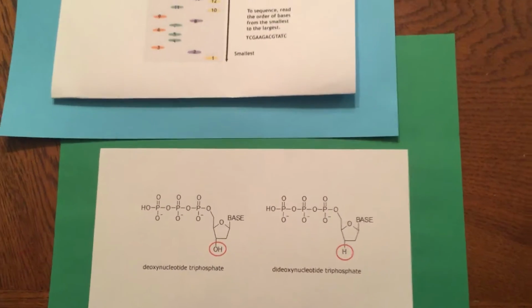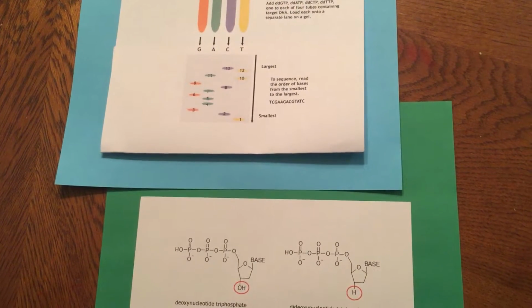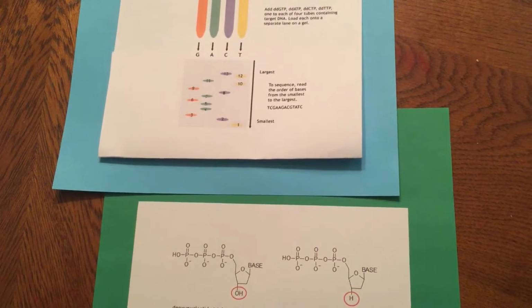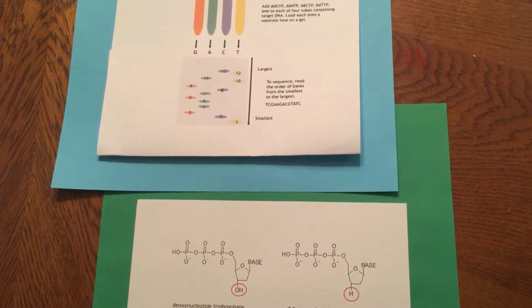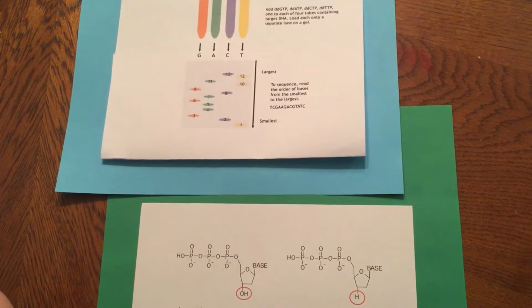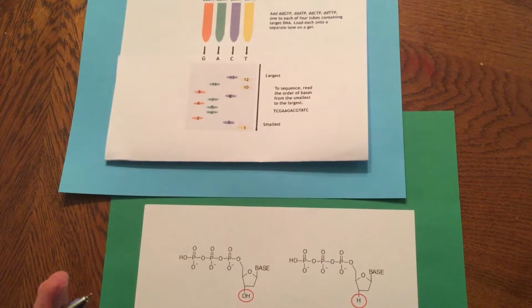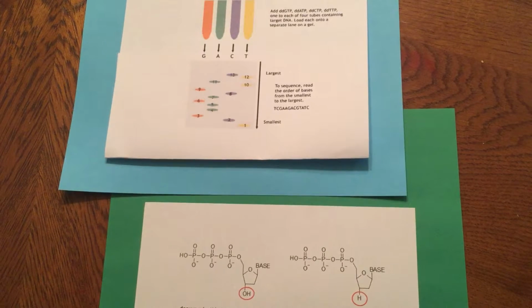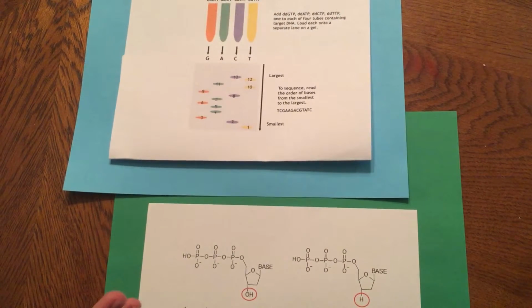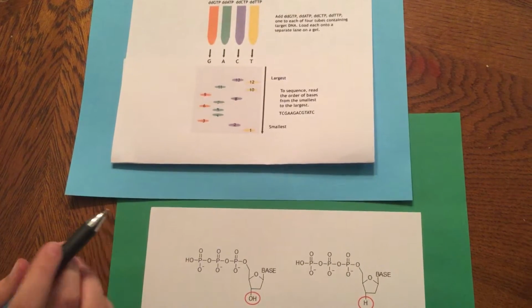And because it's only a single strand, you end up with linear amplification, whereas with PCR it was exponential because it was doubling each time we started the cycle. So that means that any future copies or applications you need to make, you must make them from the original template. You can't just keep going like you can with PCR.